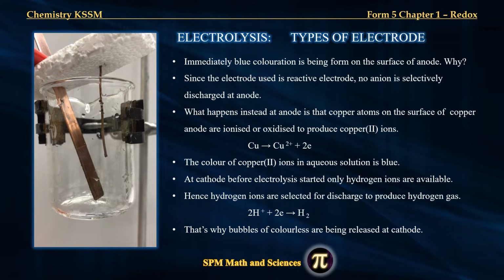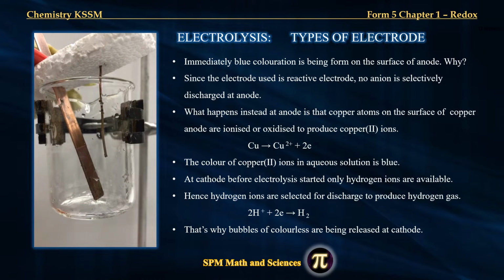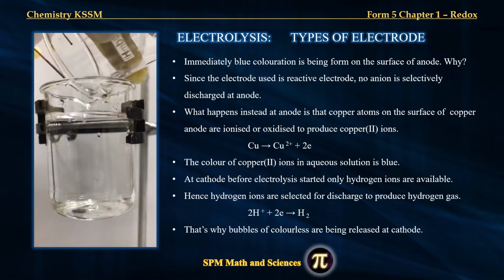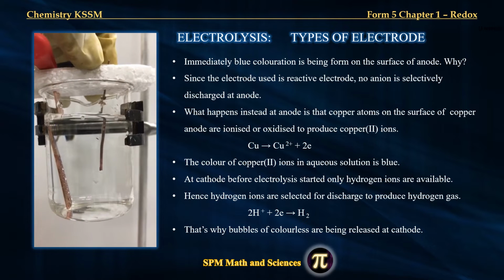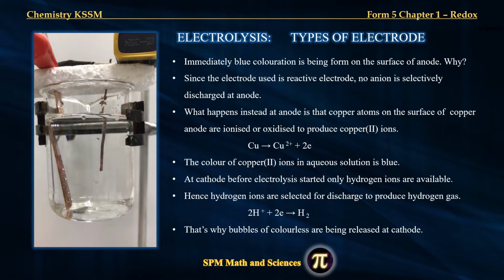Okay, let's get started. First, get the electrolyte, the nitric acid. I'm using something to stabilize it. Hopefully it won't distract the view. There's a good angle for you to observe the anode on the left hand side. Okay, ready? Put it on. There you go.